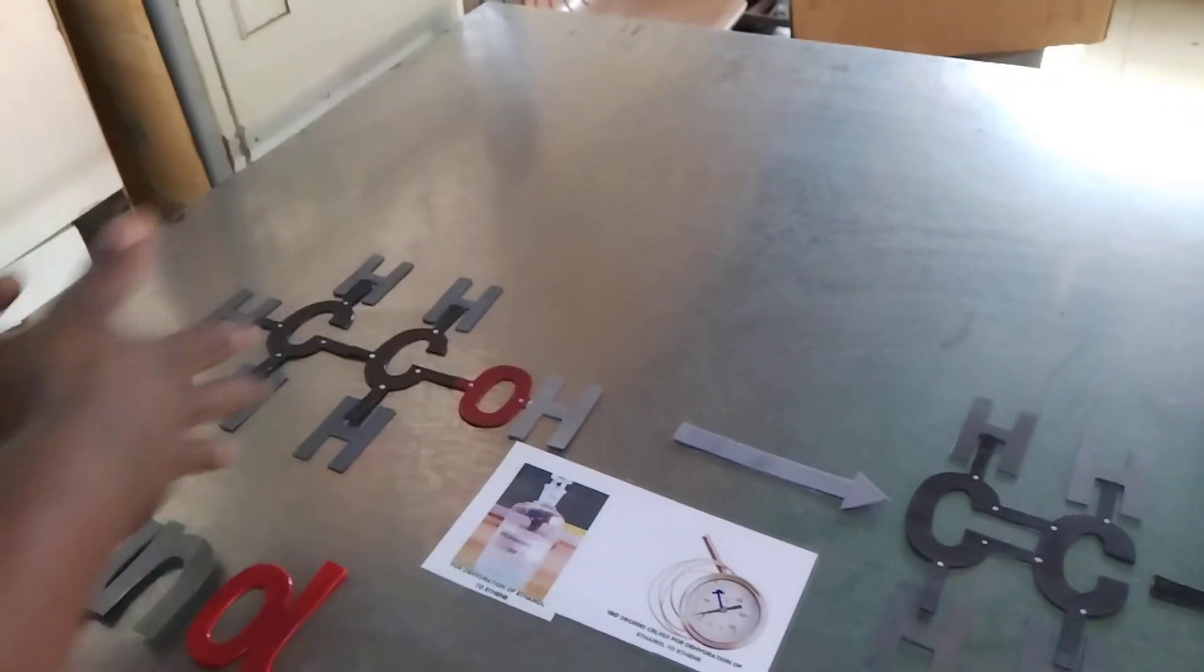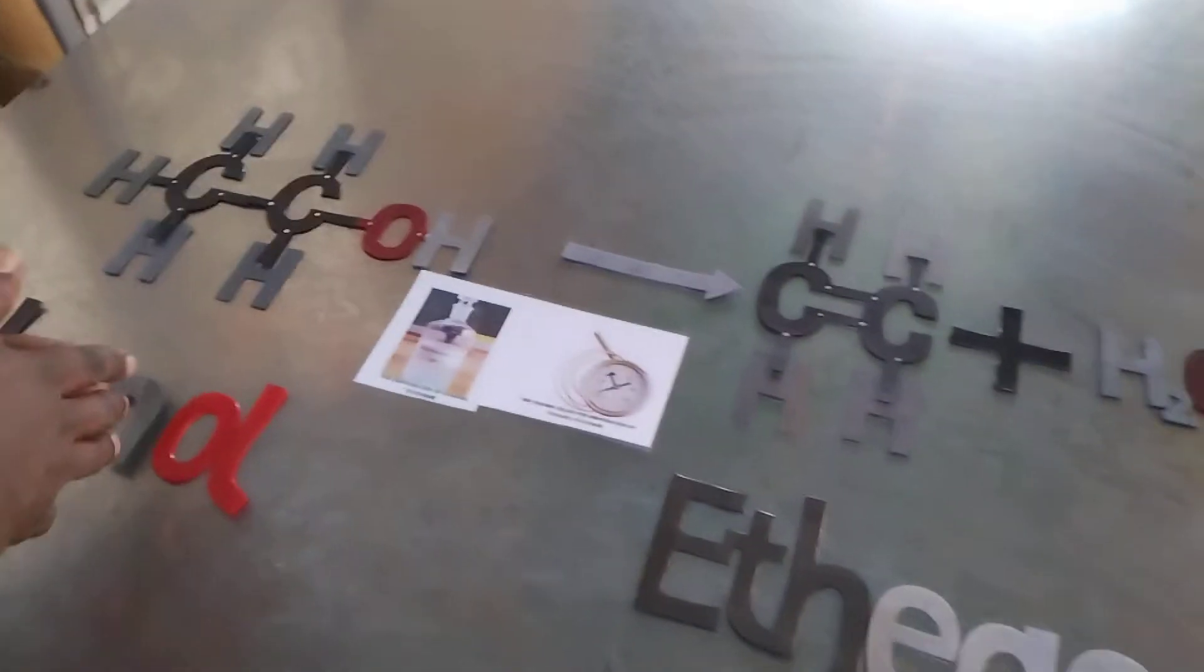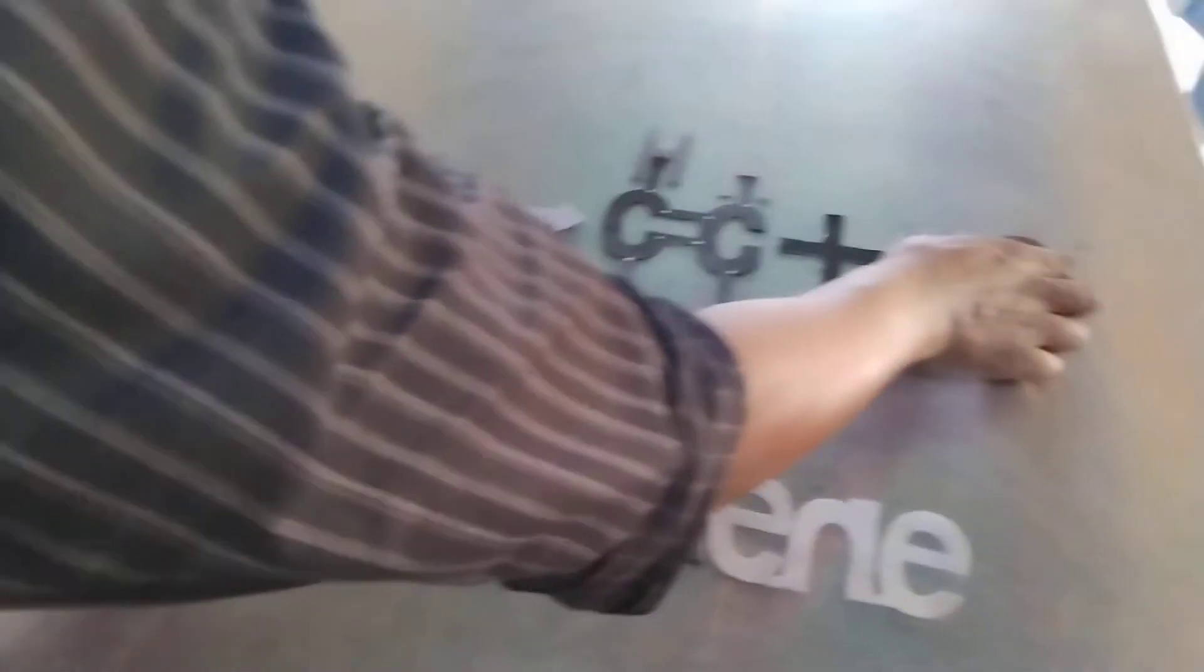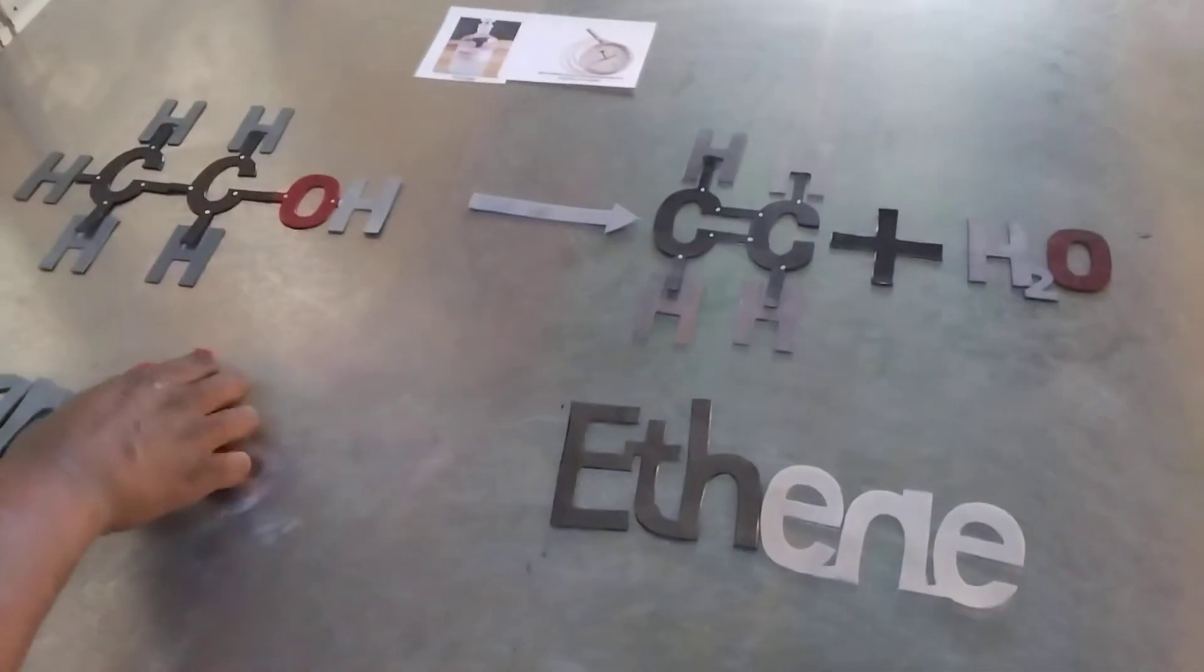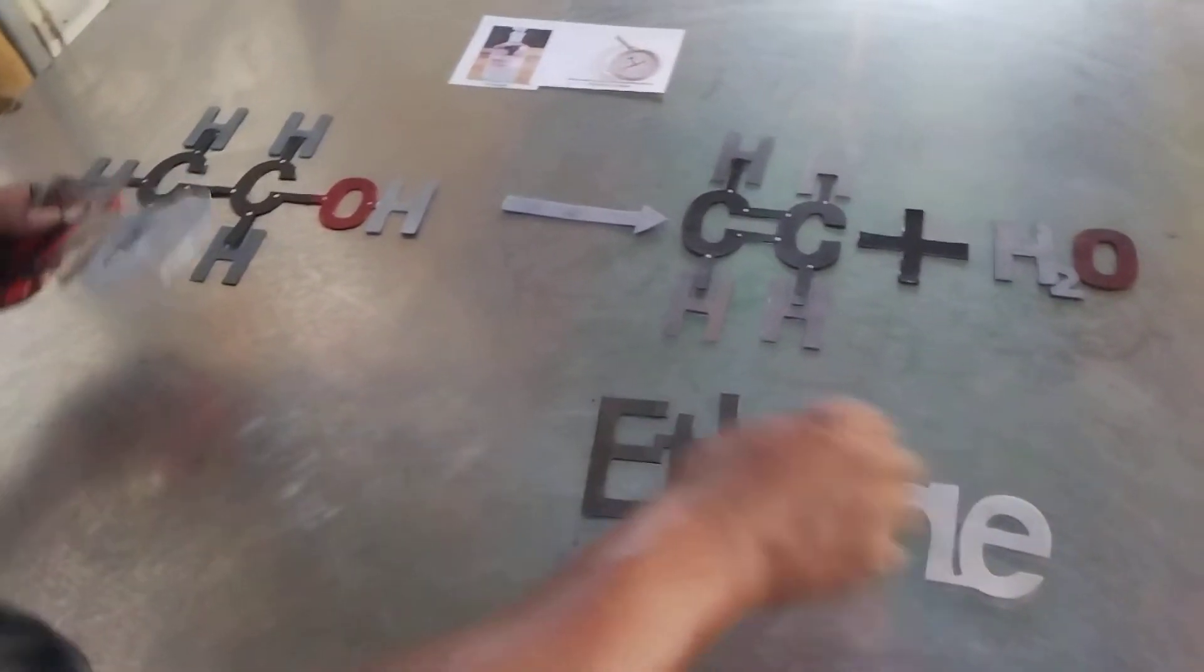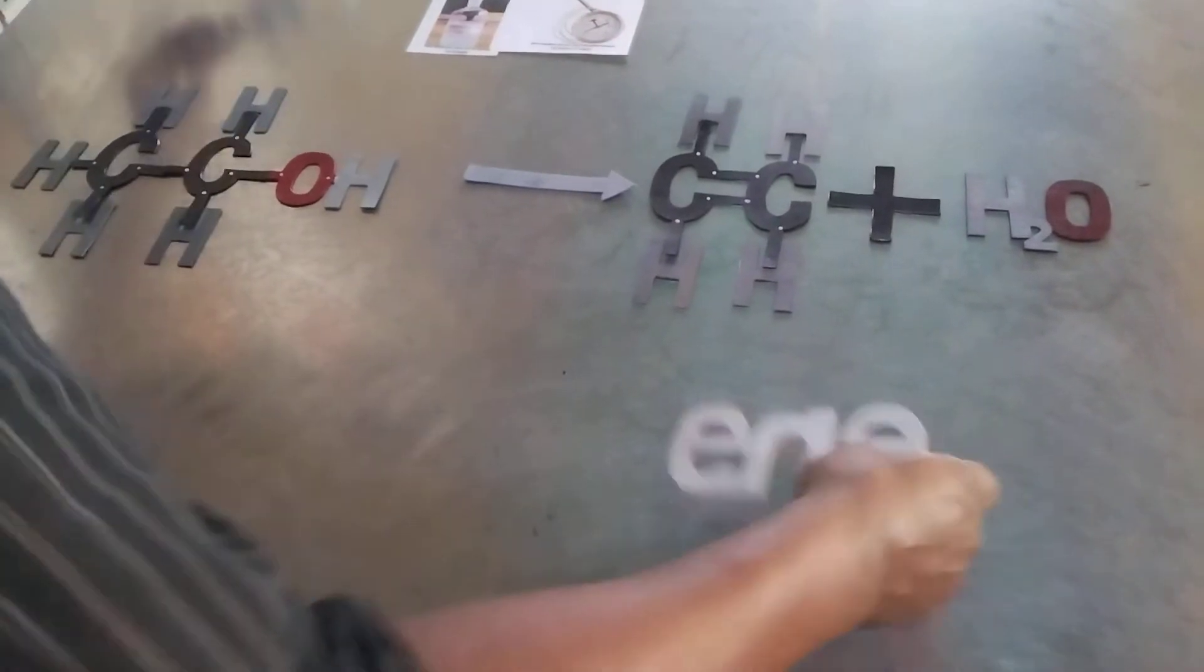Now water molecule is going to be removed from ethanol to form ethene and this water molecule here. Now to demonstrate what usually happens, you have your ethanol here. This is your ethanol.